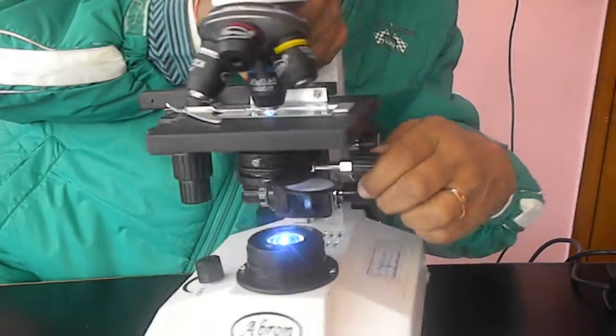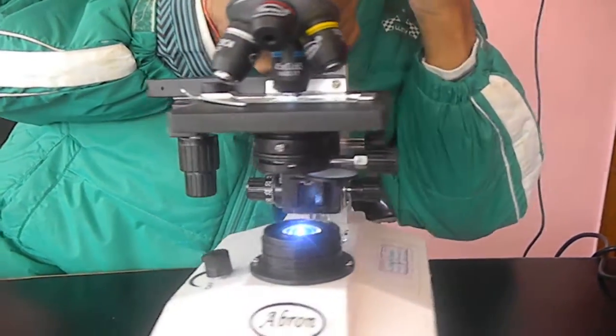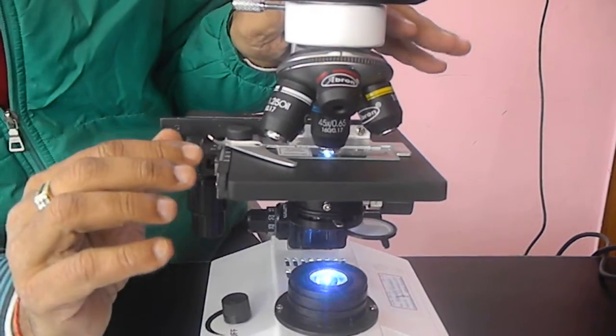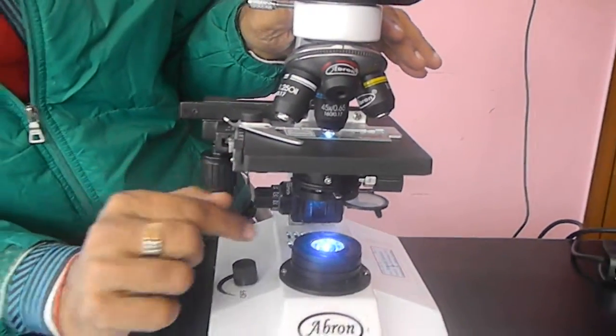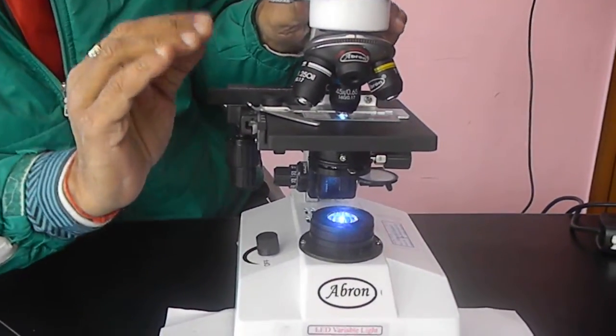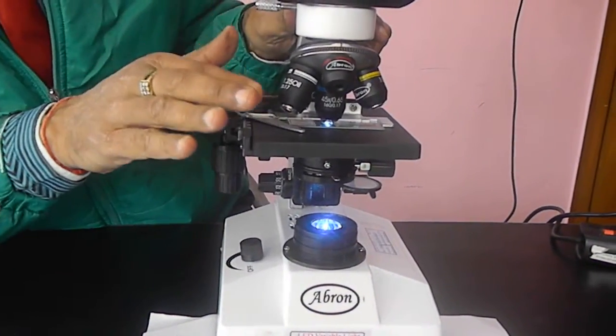And adjust a bit of condenser so that you get the better clarity of the objectives. The best way is to have the clarity only by adjusting the condenser and the iris. The light will be sharper and you will have very good results.